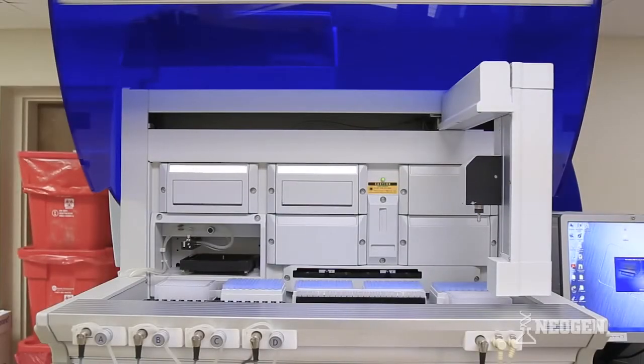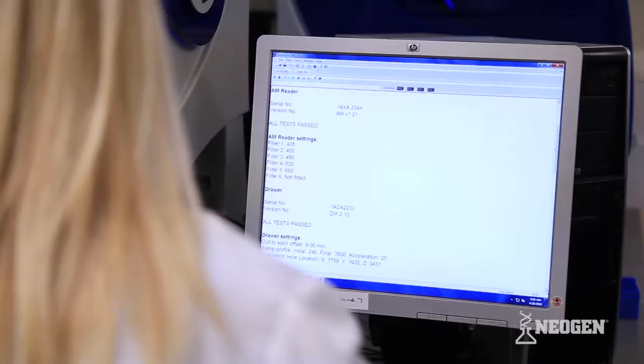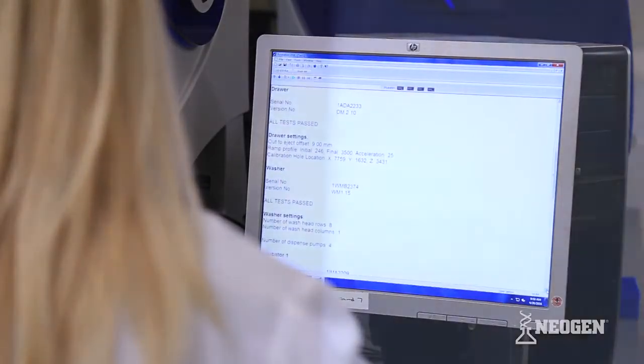After turning the instrument on, a series of self-tests will be conducted. Upon completion of these self-tests, you will have the opportunity to check the results on your monitor.